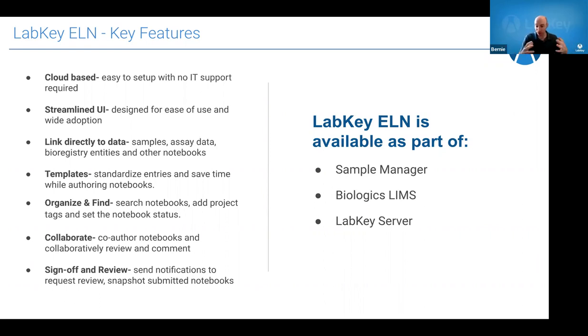For example, you can essentially ask the question, show me all the notebooks that discussed a particular tumor source, or this molecule, or that involved a particular media batch, as a means of exploring how that work went and what the results were like.